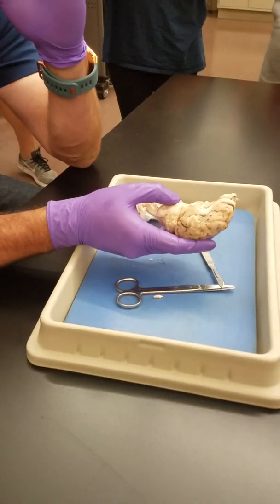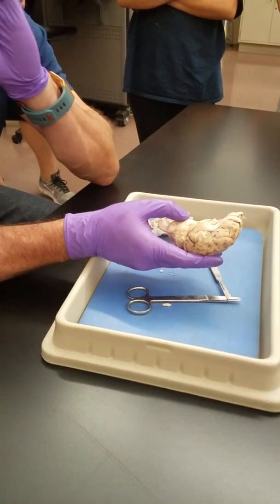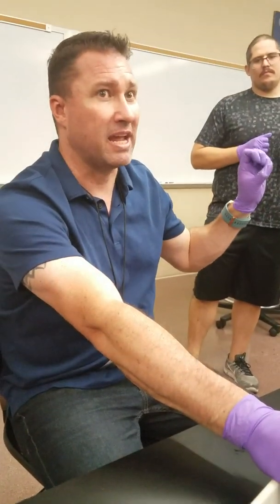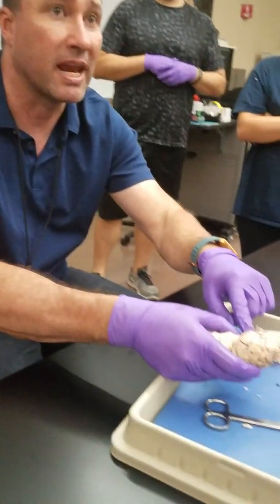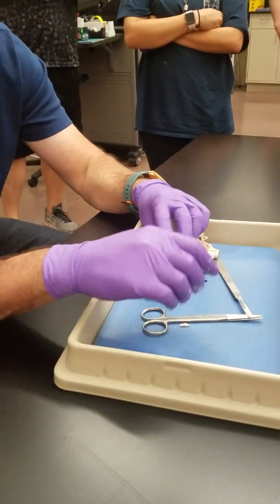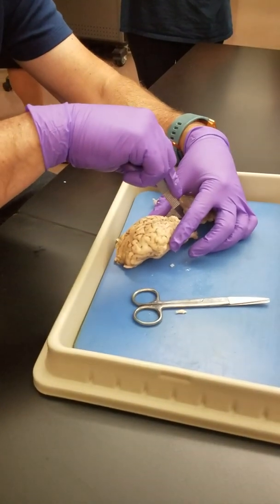Most of what your right eye sees is processed by your left hemisphere. Most of what your left eye sees is processed by your right hemisphere. When I use my left hand, my right hemisphere is controlling it and vice versa. So that is where that happens right there, in the optic chiasm, at least where the vision goes. Okay, all right, so let's cut this right down the center.